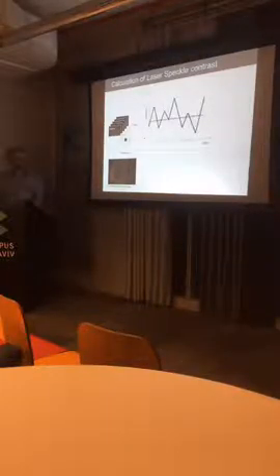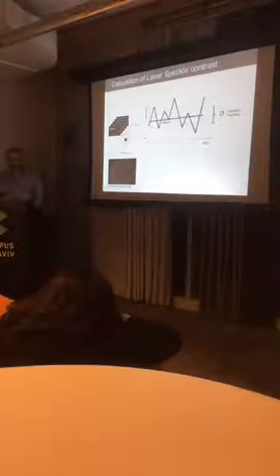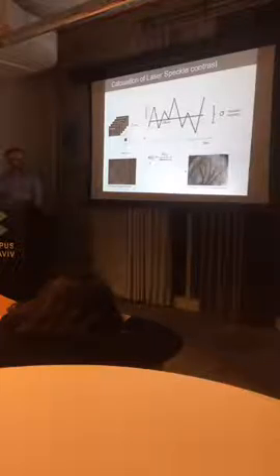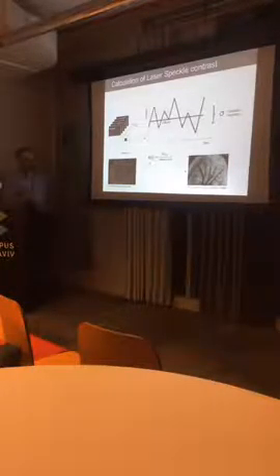Then we use a very simple mathematical equation: the mean and standard deviation. We take a formula where we divide the standard deviation by the mean intensity, and after we do it, we have magic. In this magic, we can see blood vessels.